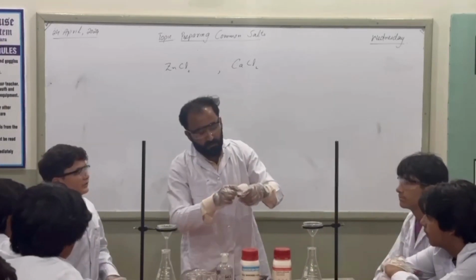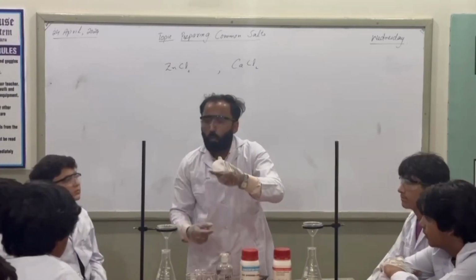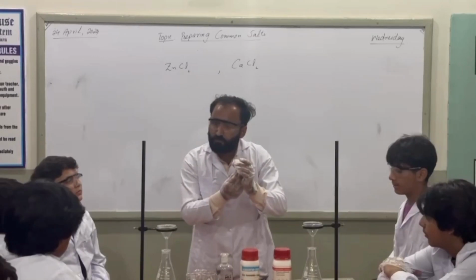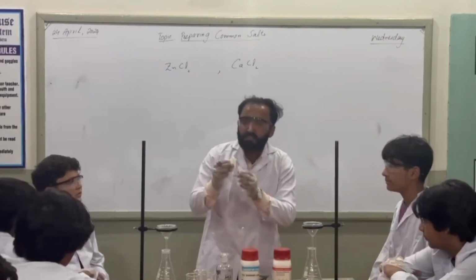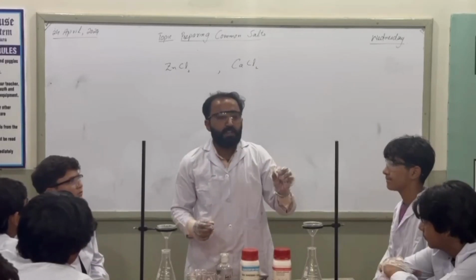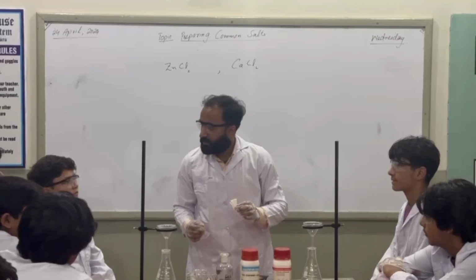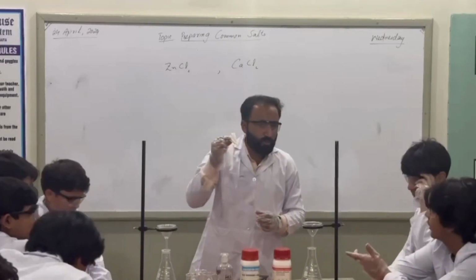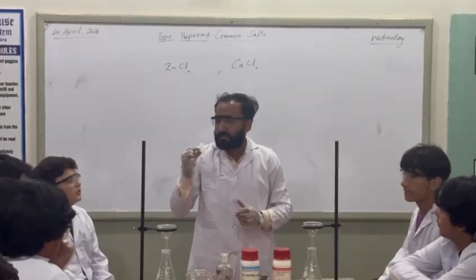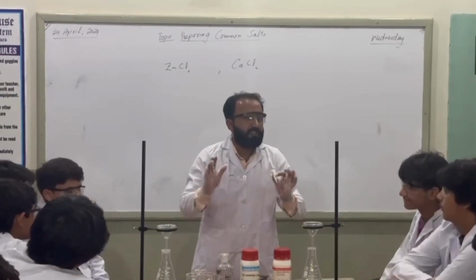Dear student, please wait. This is the simple one channel from which the solution will filter out. But in this filter paper, we have multiple channels to go for the filtration. Yes, you got it? So the rate of filtration will increase faster by using this fluted filter paper. Okay, we will observe it physically as well.